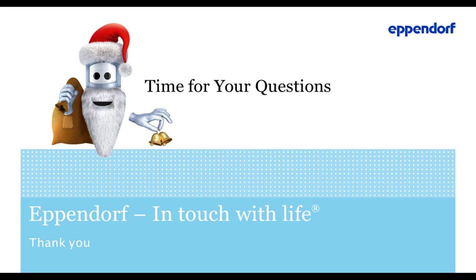Yeah, thank you for the question. As I mentioned during the different impeller types, the Rushton type is not the impeller you should use because this just causes too high shear stress. I recommend using the pitched blade impeller because this is generally used for cell culture applications, causes low shear stress, and gives good distribution of the cells within the bioreactor.